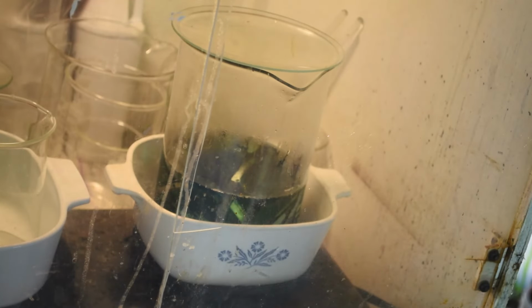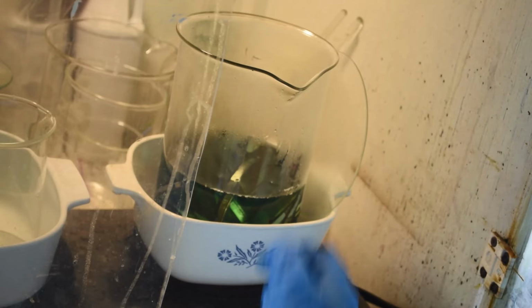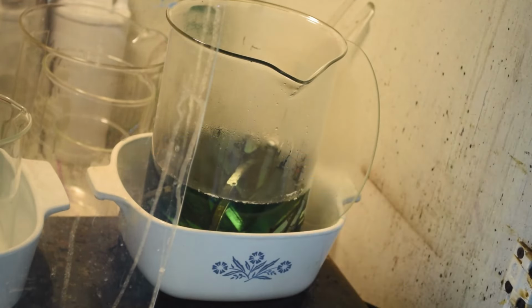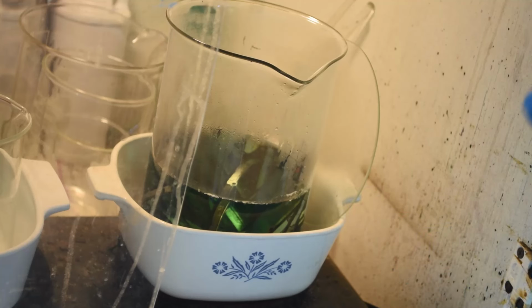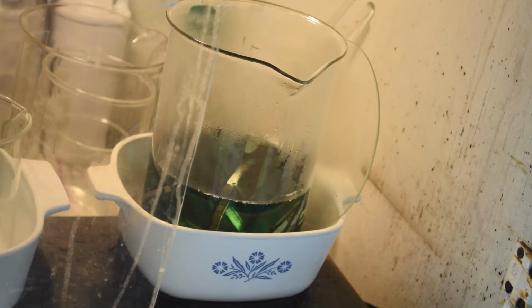Well, we had a pretty vigorous initial reaction in there, but it died down pretty quickly. There's not much going on right now. There is a little bit of bubbling. I don't know if that's showing up. There's still some bubbles rising in there, and it's not that hot, so it's not boiling. So there is still some kind of reaction going on, but it's pretty weak. And I'll tell you what, the liquid has turned a bright green. Okay, bright green. So what is that?